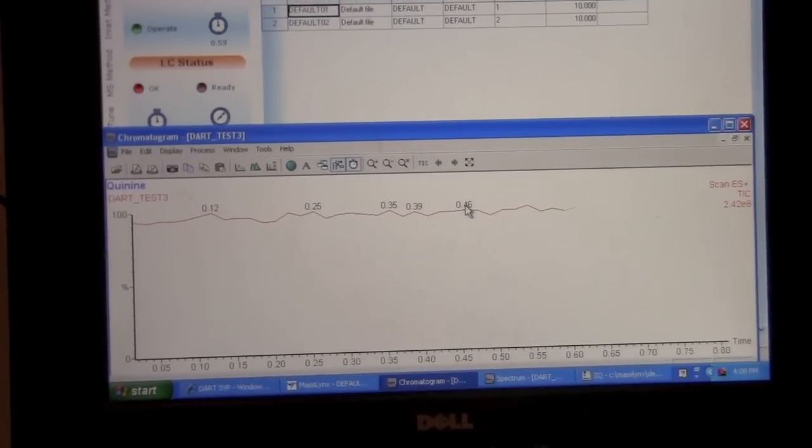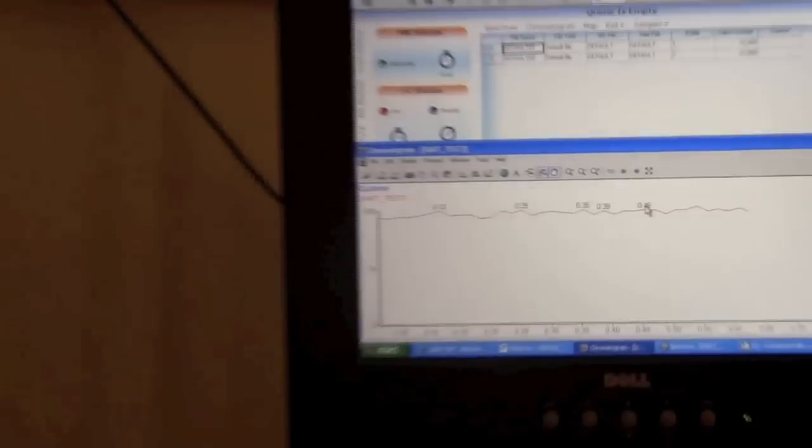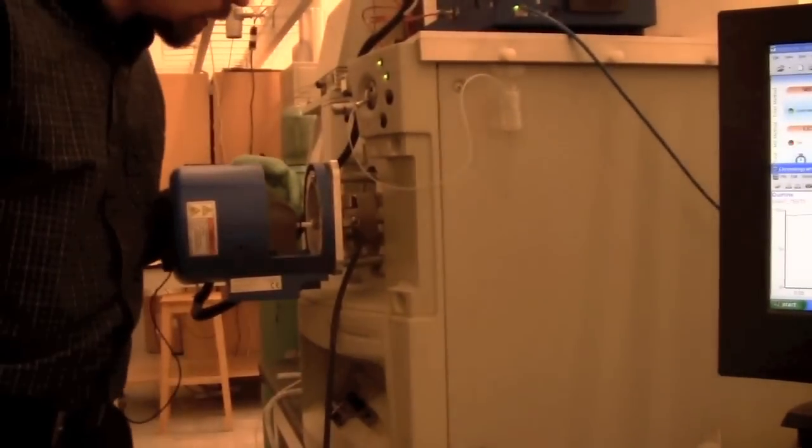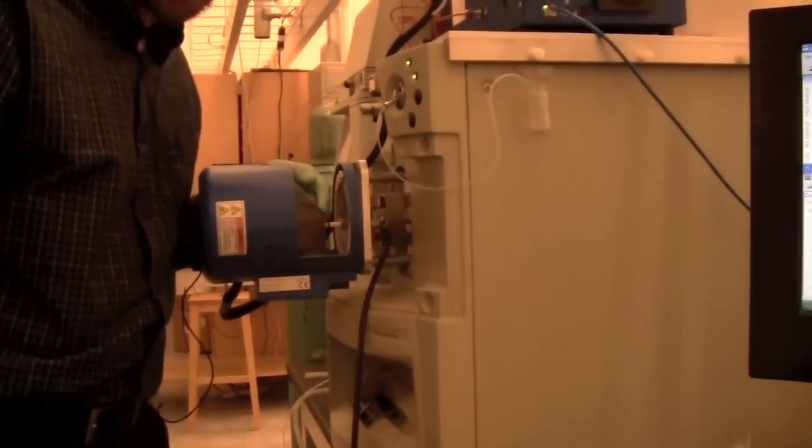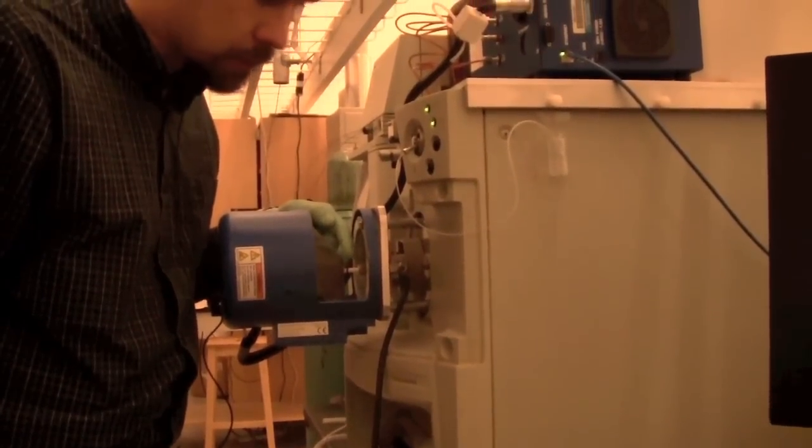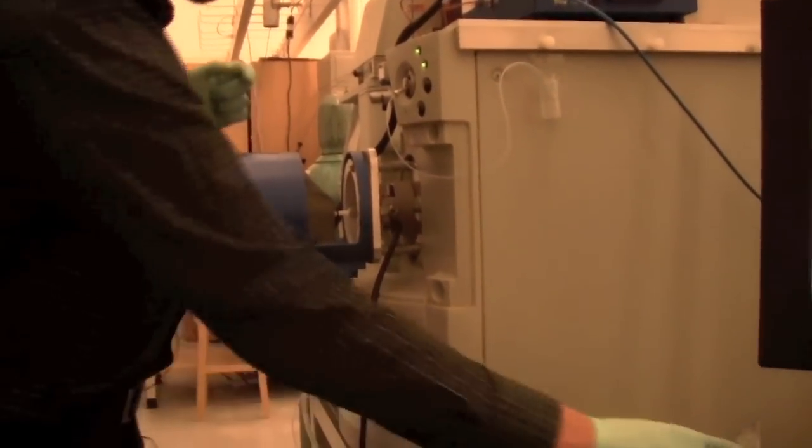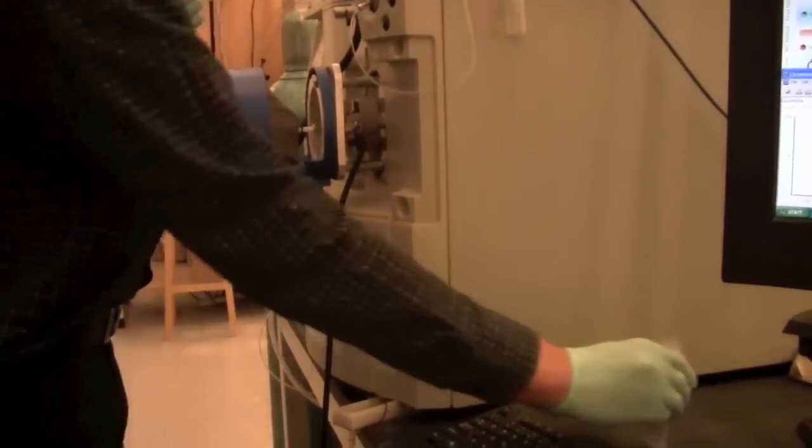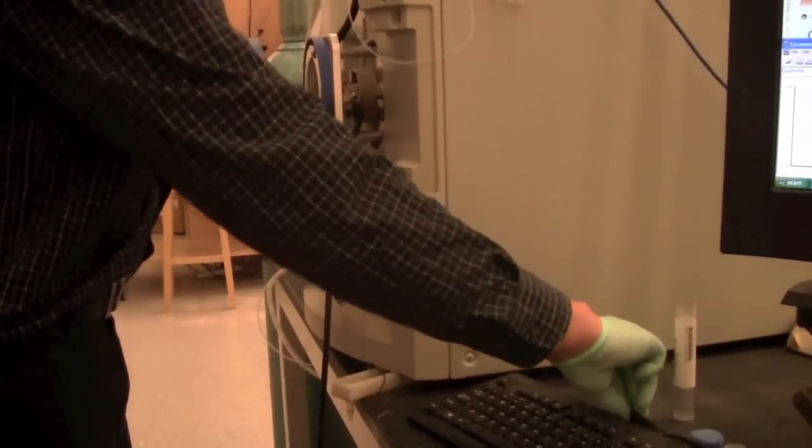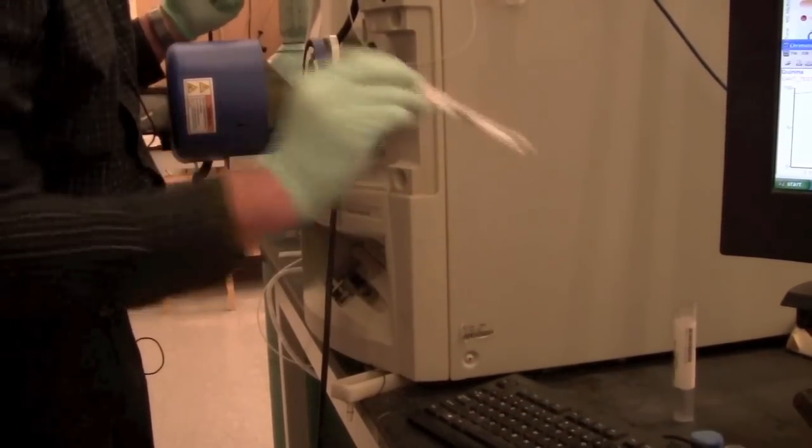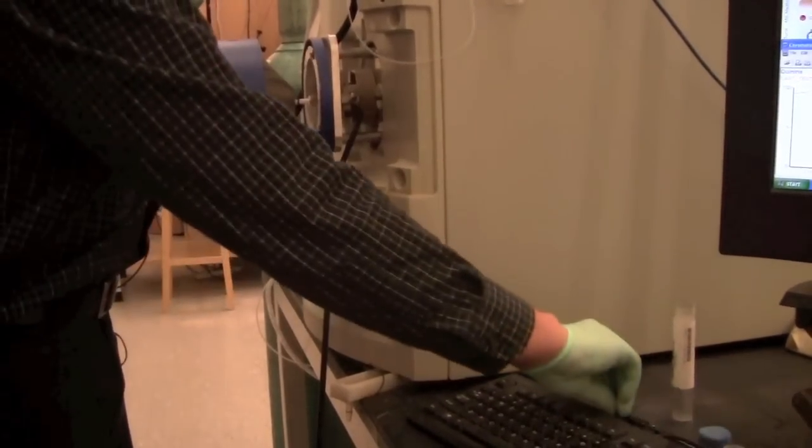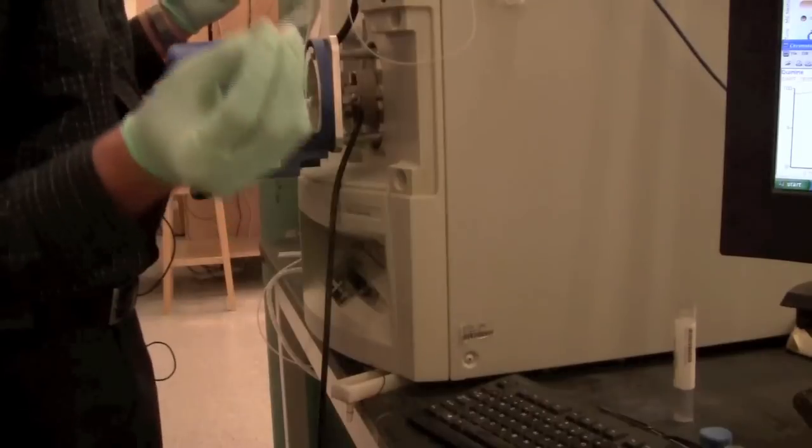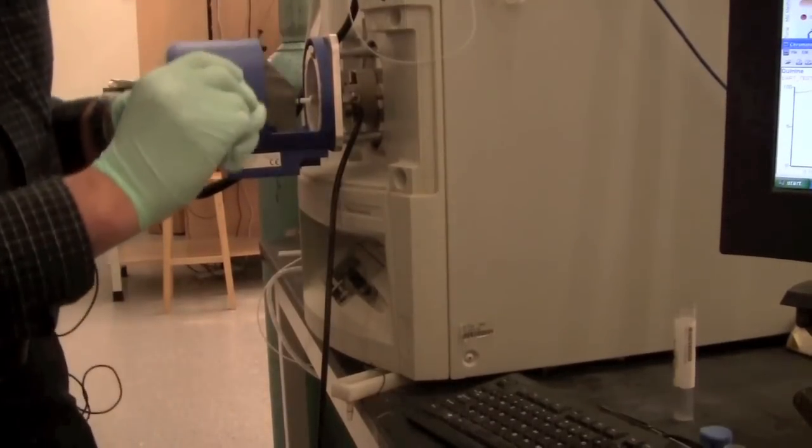So now we're looking at the chromatogram here and we can start to put the sample in. The sample is anything that goes in the gap between the source and the inlet of the mass spectrometer. So you can use a capillary, you could use a solid sample if you wanted to, or you could use a sealed capillary. It often works the best.